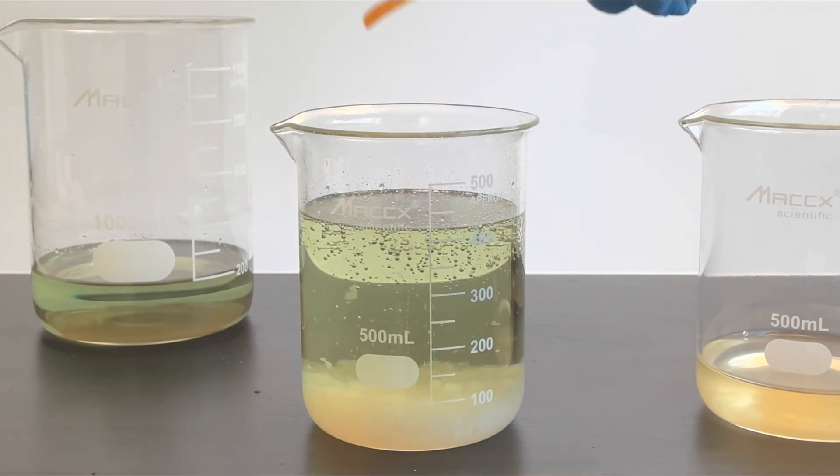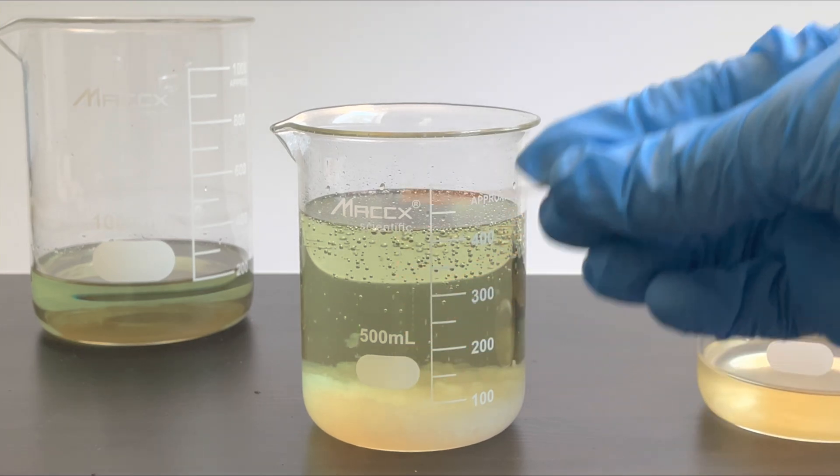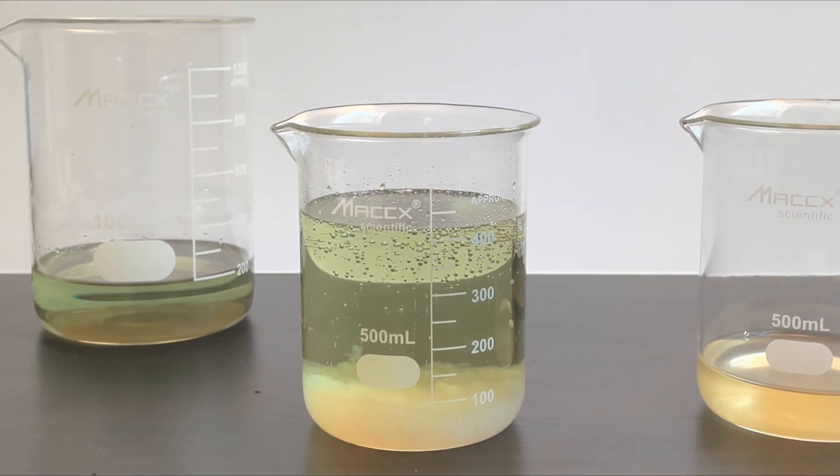Now we can measure the pH of the solution. It's pretty acidic right now, which is rather interesting. Maybe we can add some more base.